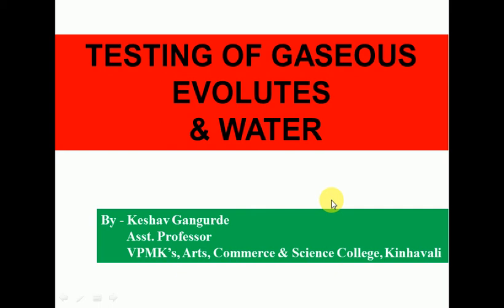In this video, I am going to discuss with you about testing of gaseous evolutes and water. While performing the practicals of inorganic chemistry like semi-micro qualitative analysis, we perform certain tests in which we detect the evolved gases.